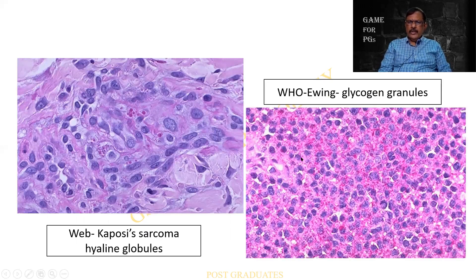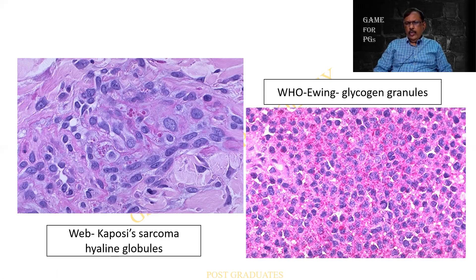Some of the applications of the PAS stain — here I am finding globules in the cytoplasm in a case of Kaposi's sarcoma. I hope you are able to appreciate the magenta coloured globules in the cytoplasm. And sometimes you will have difficulty in diagnosing a small round cell tumour — do a PAS, and if it is granular and positive, it can turn out to be Ewing's. Correlate with clinical and radiological pictures.